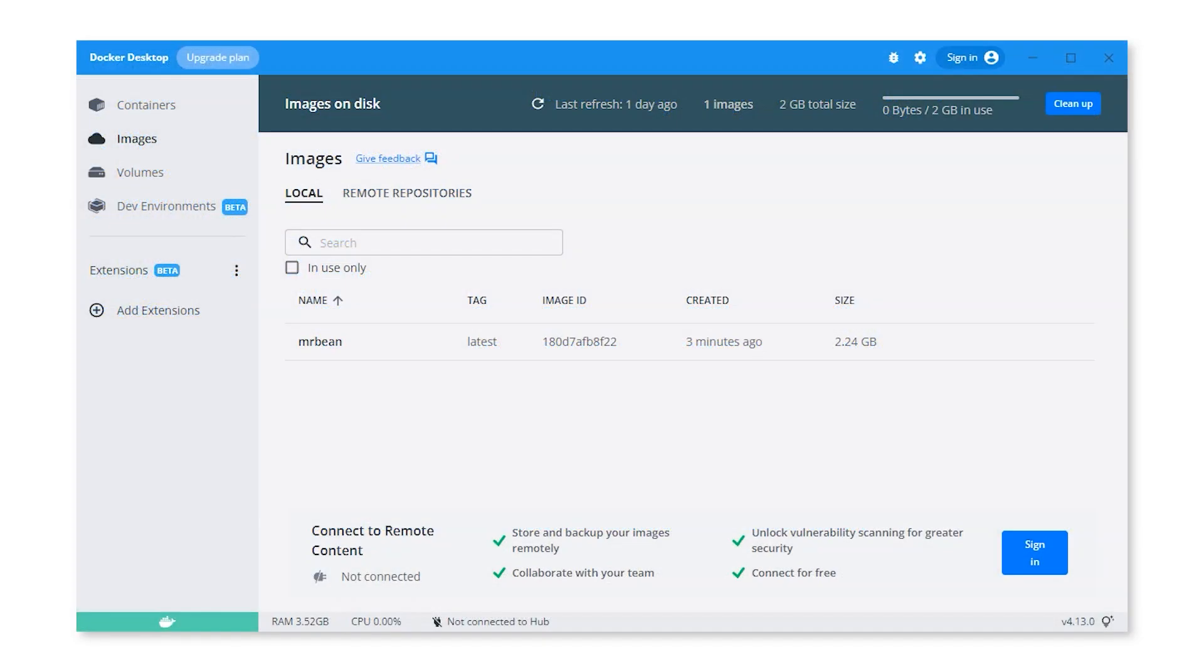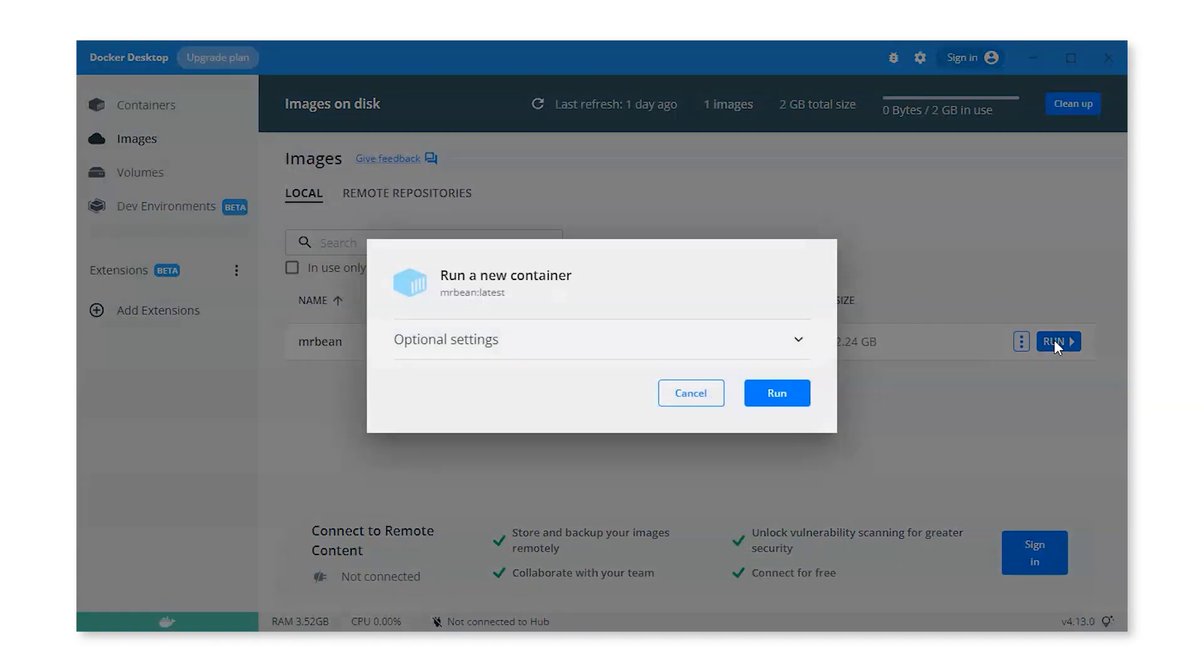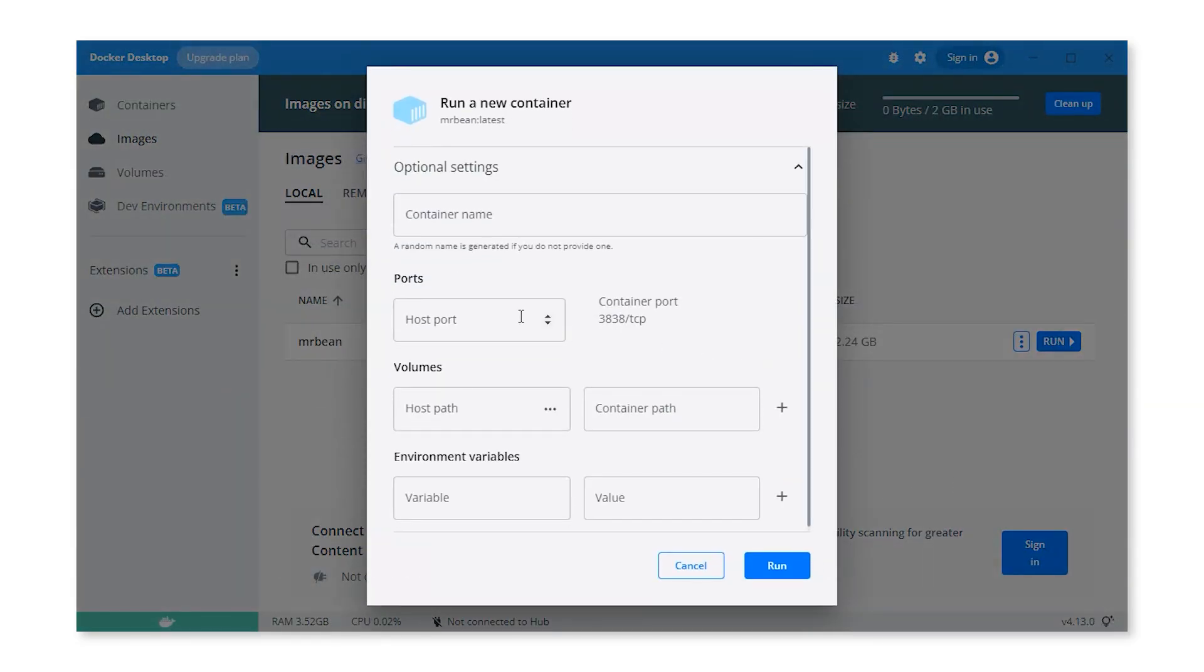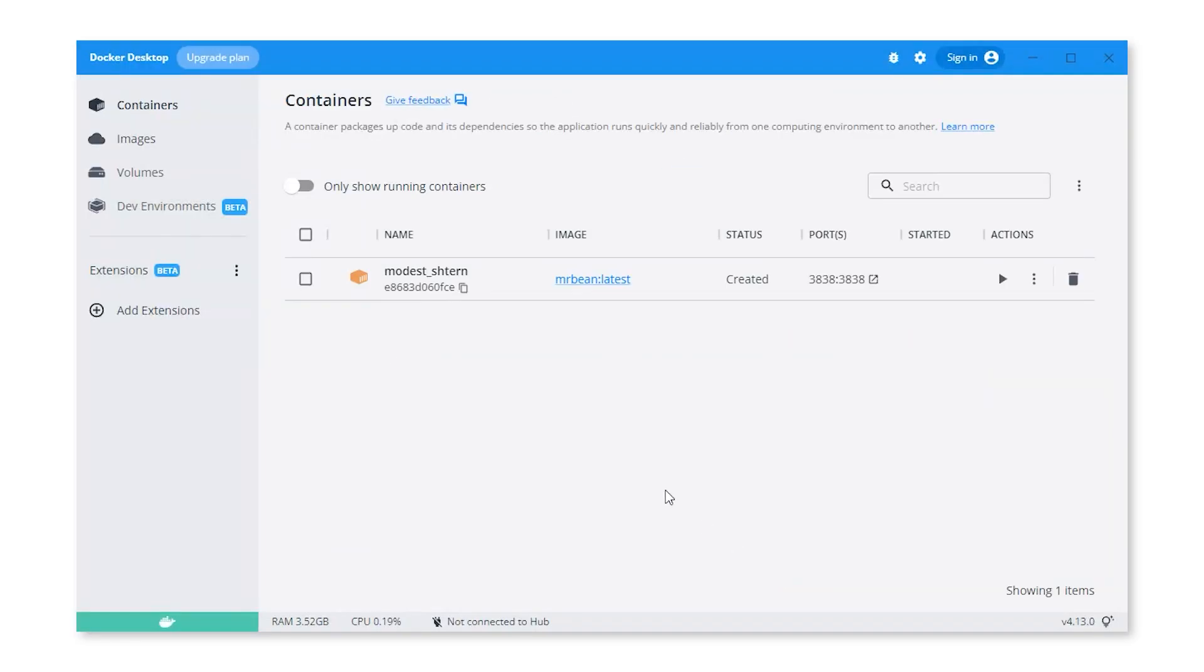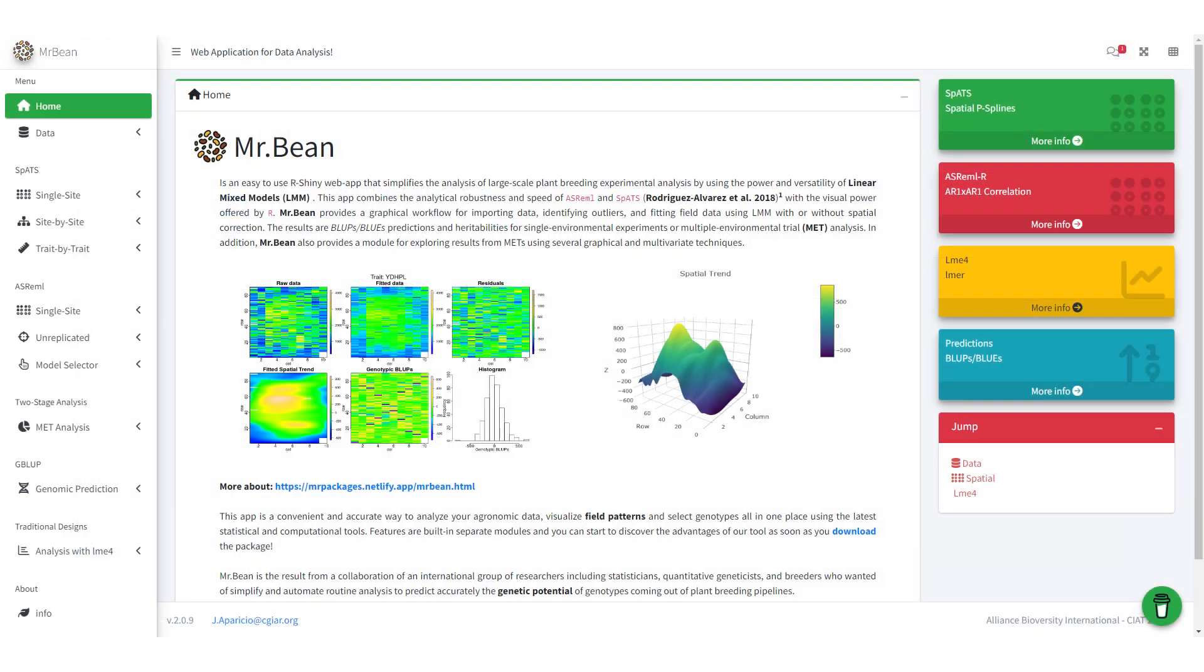Then, open Docker Desktop and run the container by clicking the run button on the MrBean image we created. Set the host port to 3838. Now, go to the containers in Docker and open the link to port 3838, and the MrBean app launches.